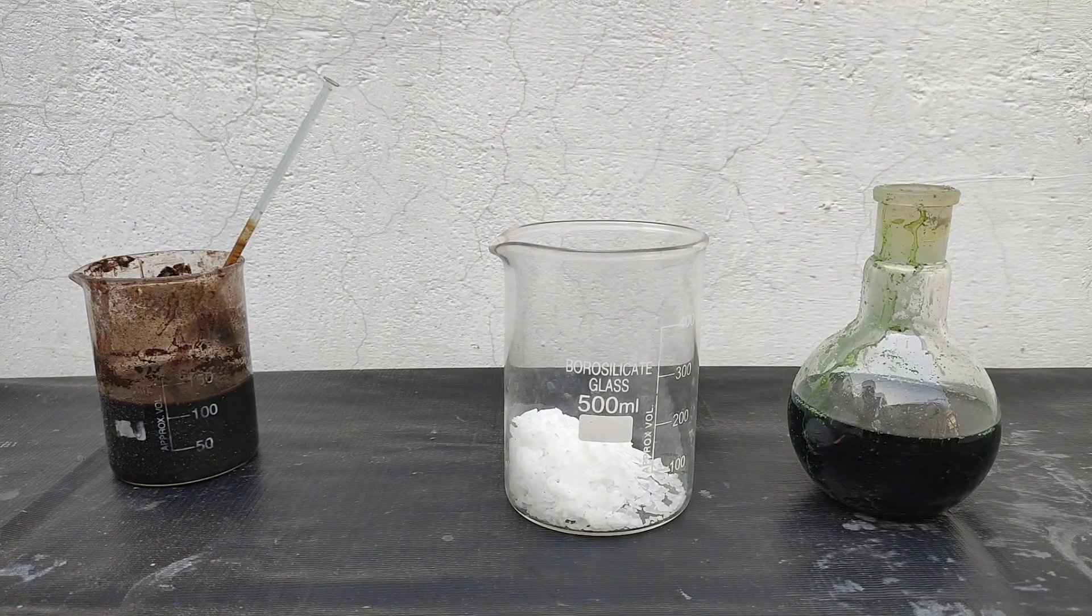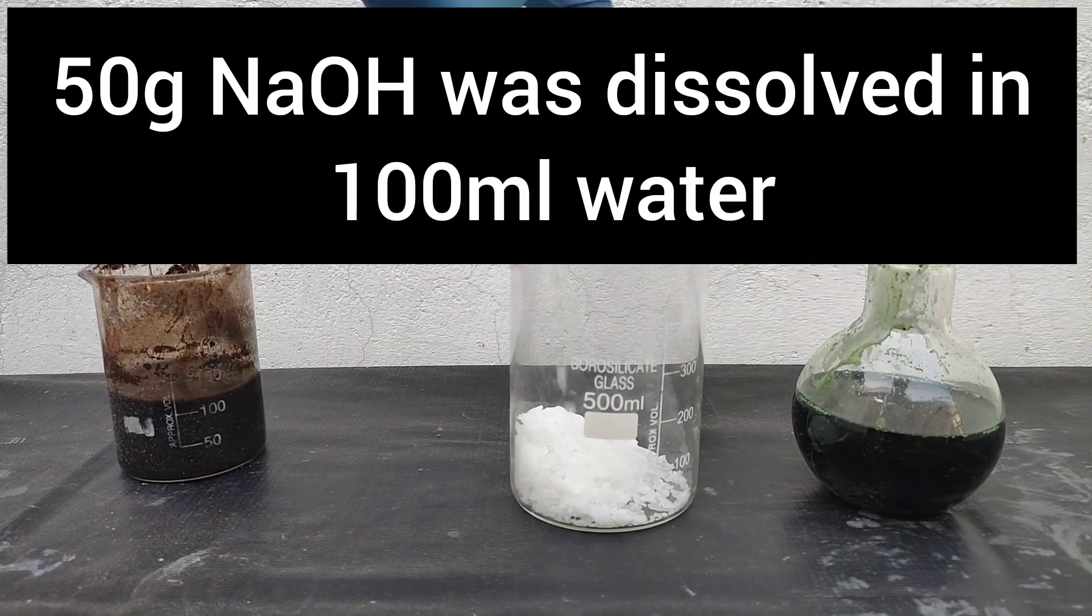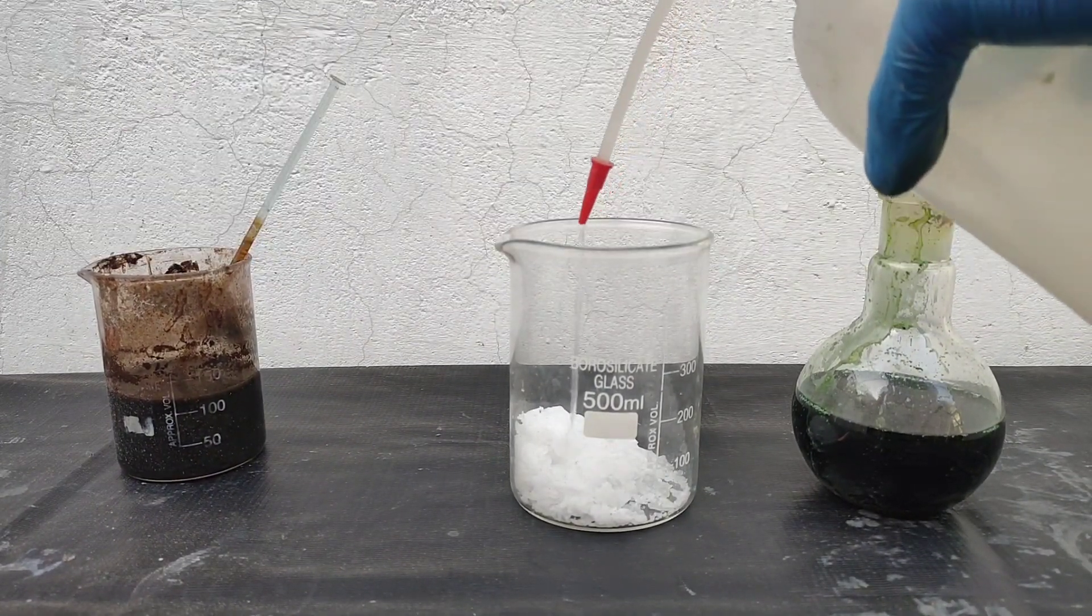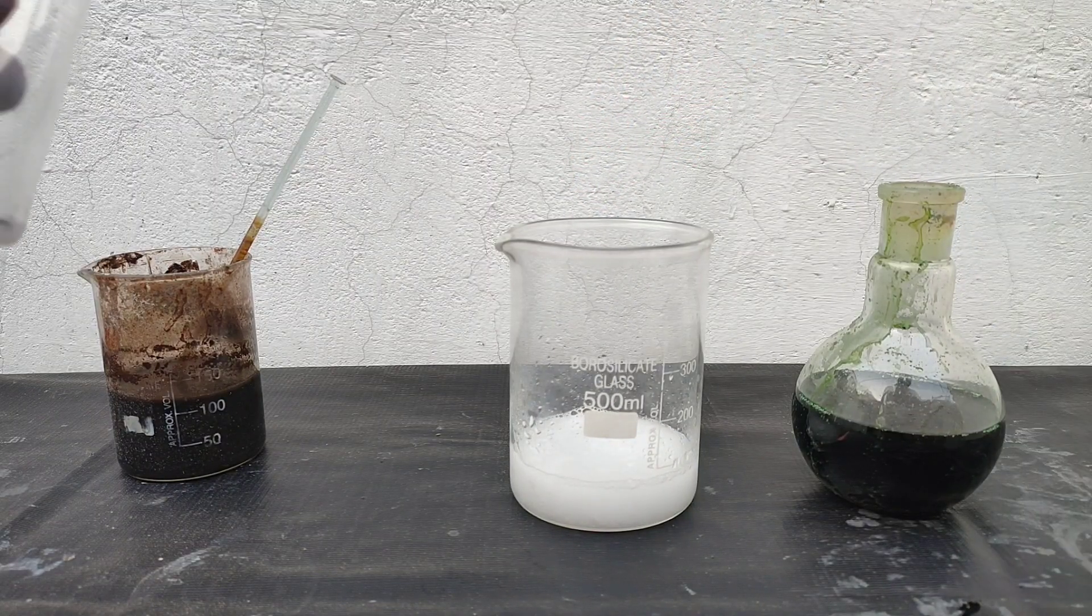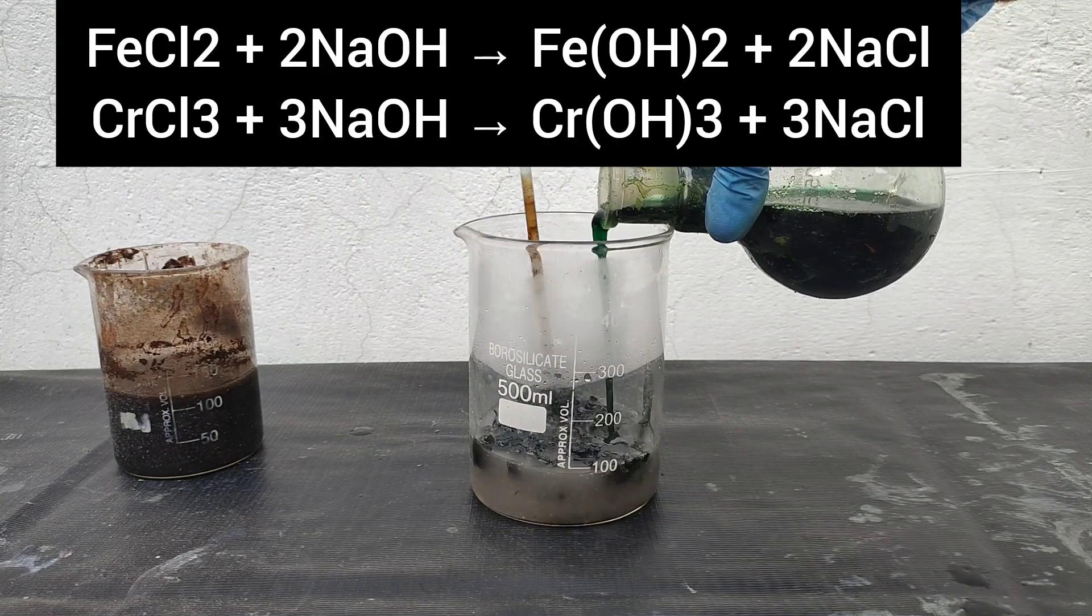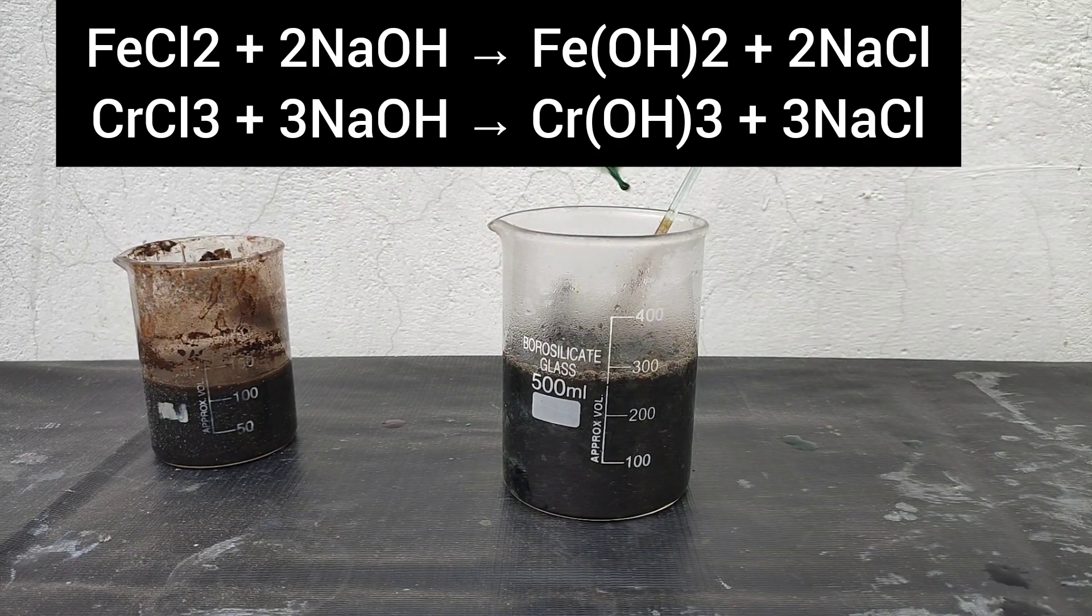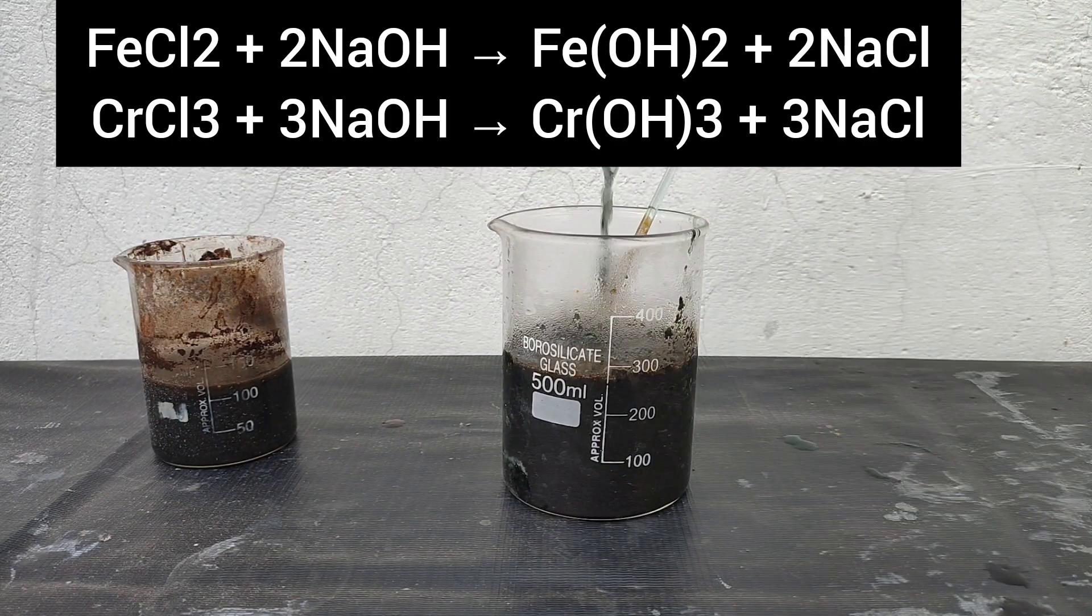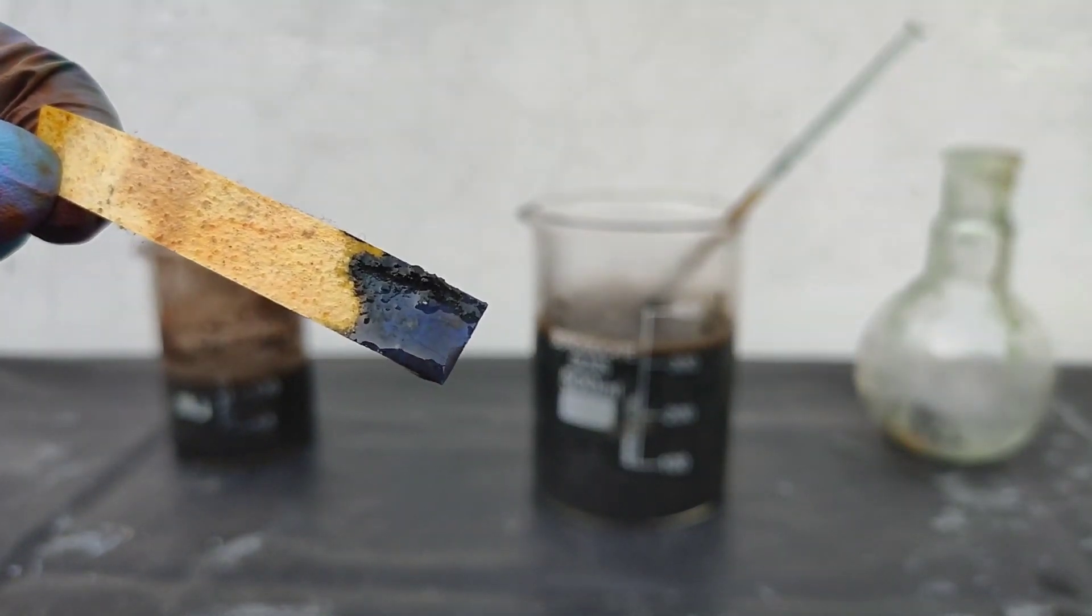Now in a 500 ml beaker, I took 50 gram of NaOH, which is equivalent to the acid used, dissolved it in distilled water, and then with constant stirring I poured all the solution in it. This converts the soluble iron(II) chloride and chromium chloride into ferrous hydroxide and chromium hydroxide. I checked the pH and it showed that it was highly basic.